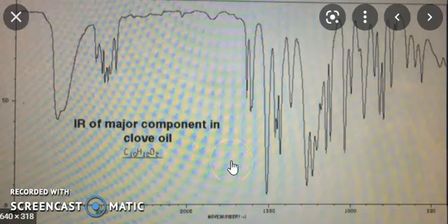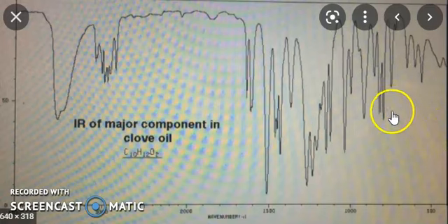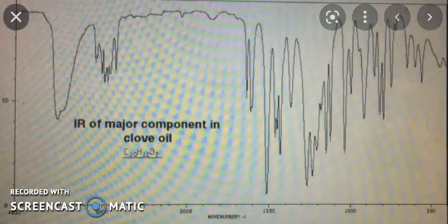You can see this peak belongs to carbon-carbon double bond. This peak belongs to OH groups, and this region is the benzene ring. So this is a spectra, percentage versus wave number. So friends, I hope this video will be helpful to you.